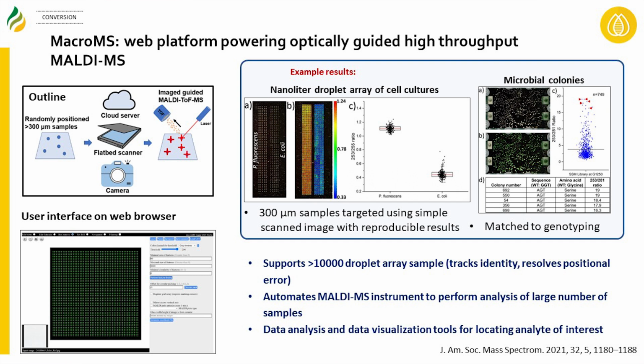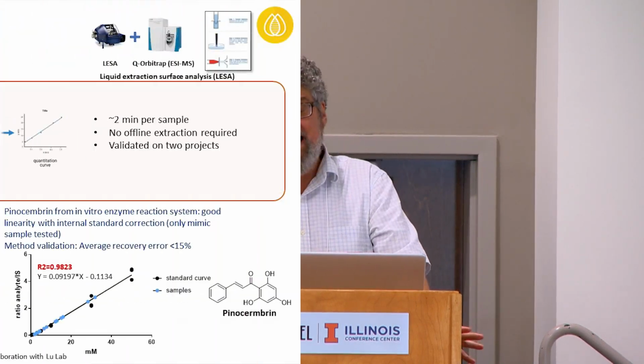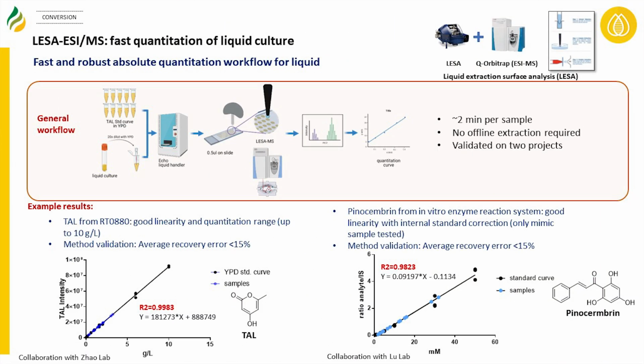If you image it and figure out where the locations of the samples are, then our mass spectrometer will use a laser or an ion beam and sample each one. And it's quite fast. And the second approach, just a little bit more information, does provide an absolute amount, and they have different flavors. Because of the way the mass spectrometers work, they work a little bit better if you're working with isomers or if you need low molecular weight or volatile materials. Both of these are available, and we're using these for more and more samples.